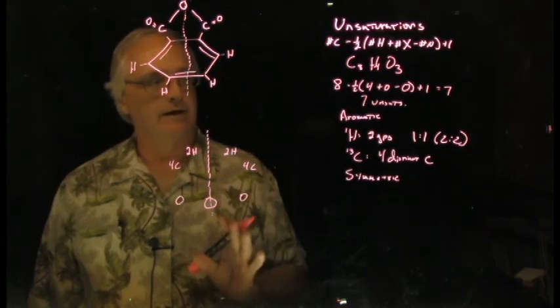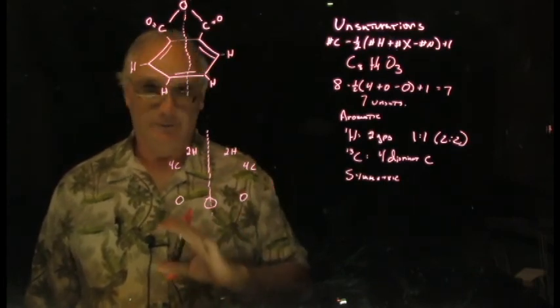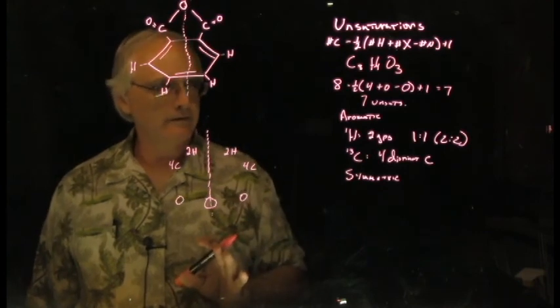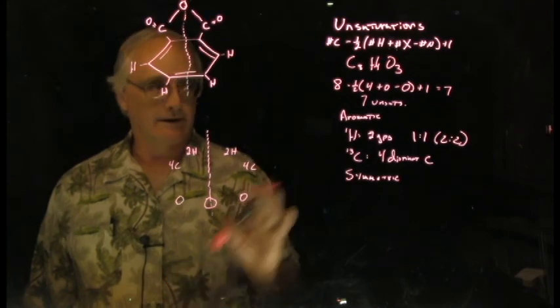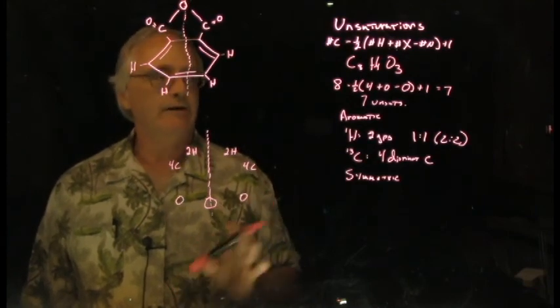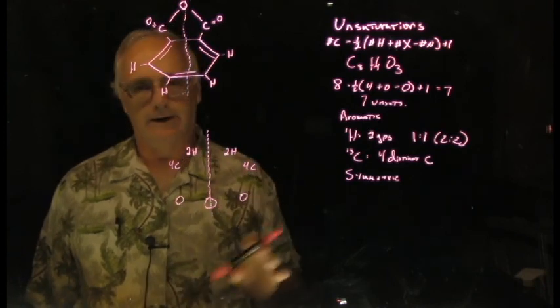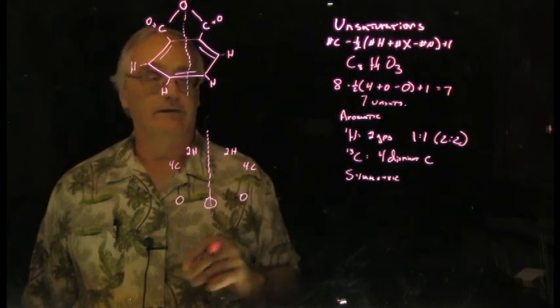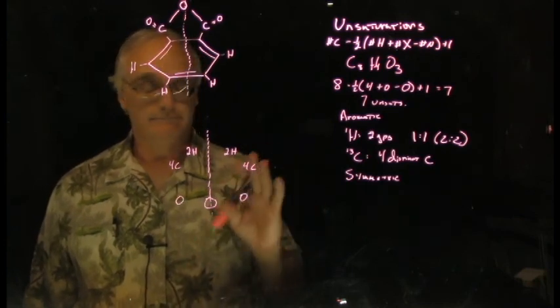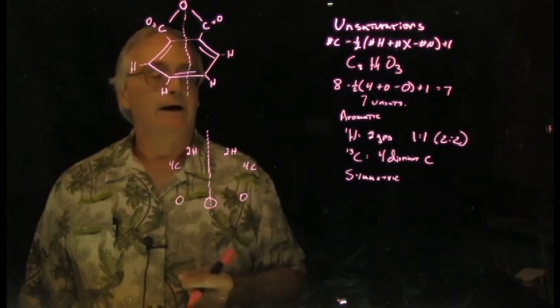This is one of those things that it really just takes a lot of practice. And so just about every single assignment we do from here on out is going to have a couple of these problems attached to it, simply because there's no other way to learn how to do this than to do it. Just practice it several times until finally you start to see the patterns involved.